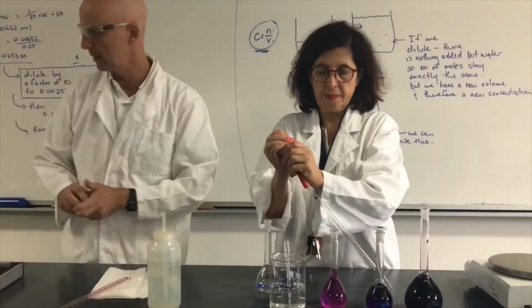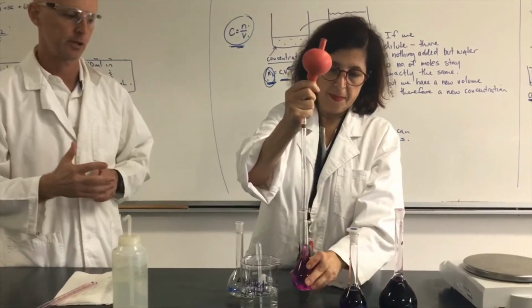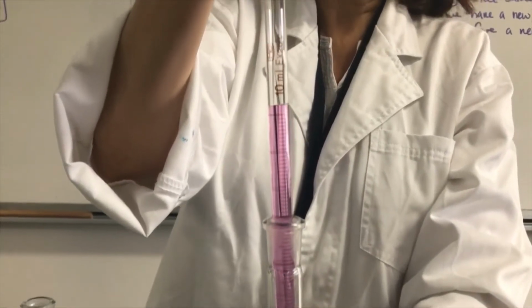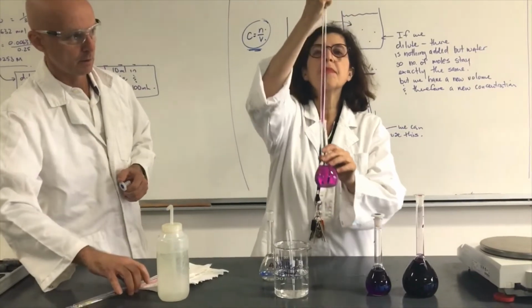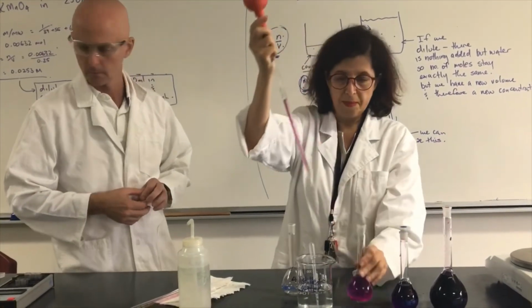So that's all the prac is really, guys. Making sure that you can make up a solution of known concentration, understand how you might dilute that in a physical way in the lab, using the correct glassware and the correct technique to be accurate.